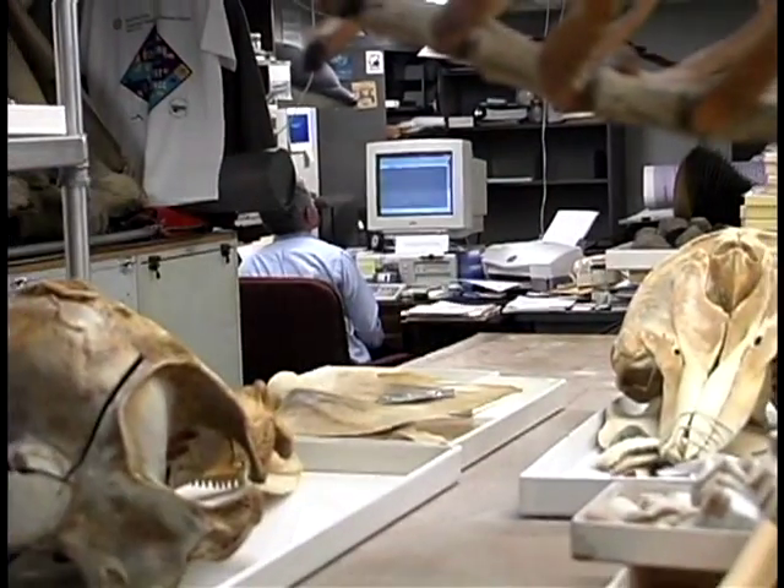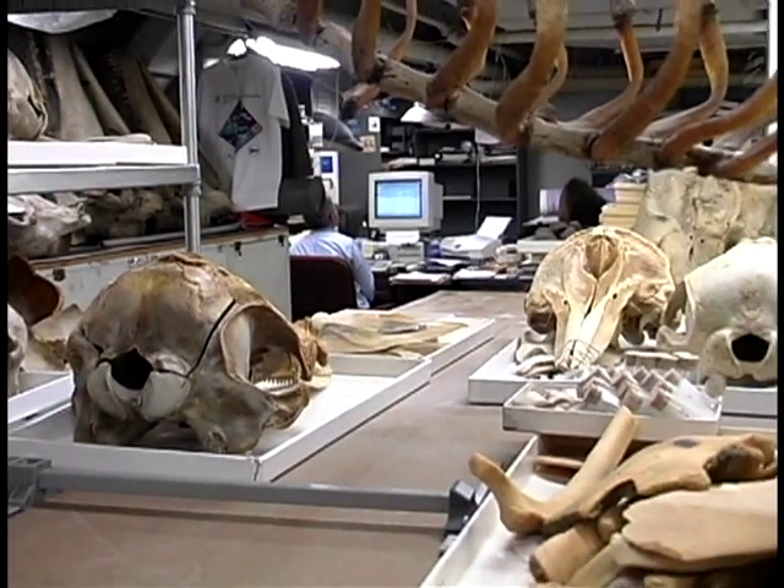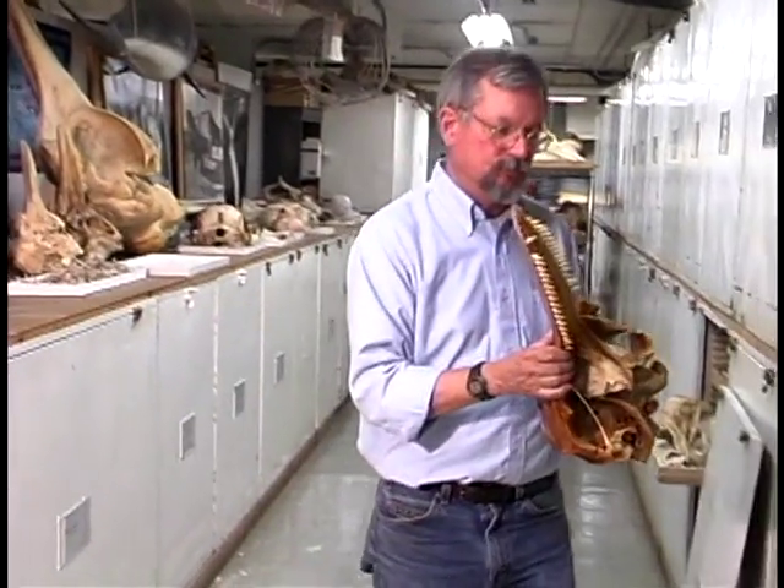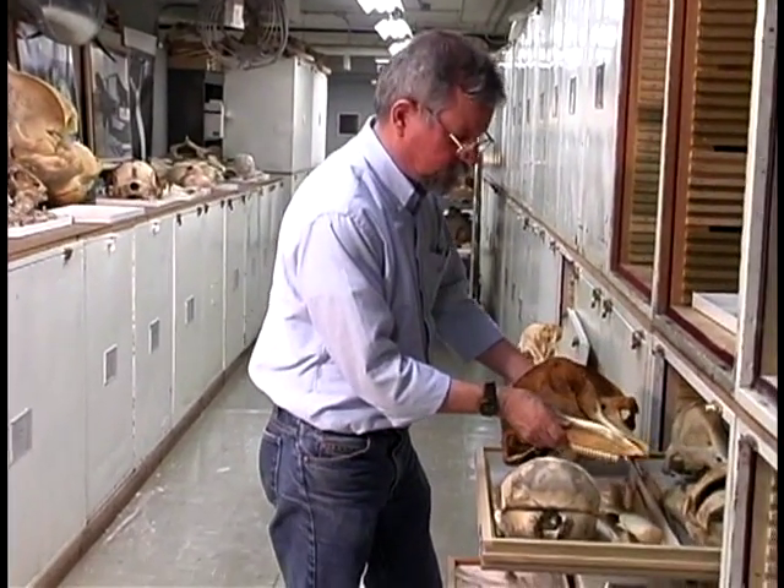After a specimen is cleaned and dried, we carefully box it up, catalog it with a unique identifying number, and store it in a museum drawer where it is available to researchers or put on display for visitors.